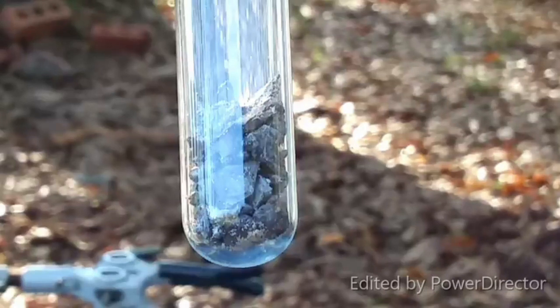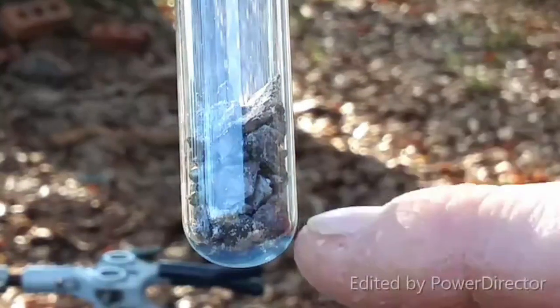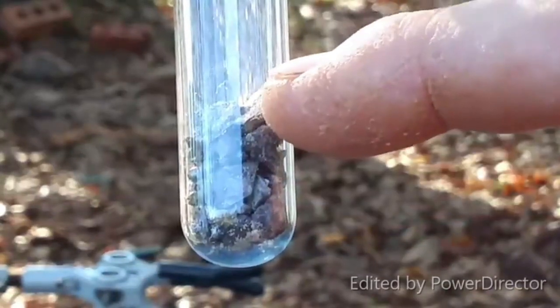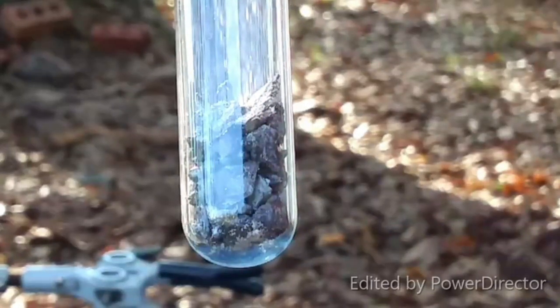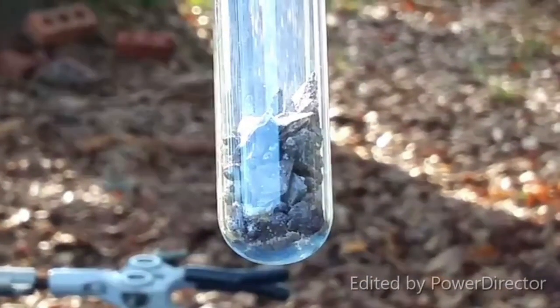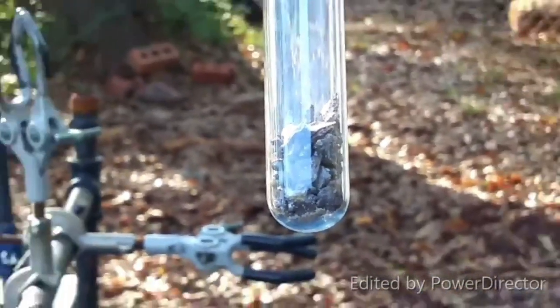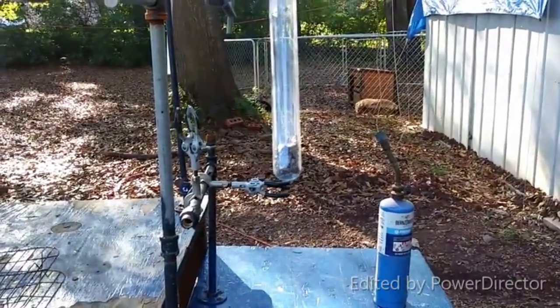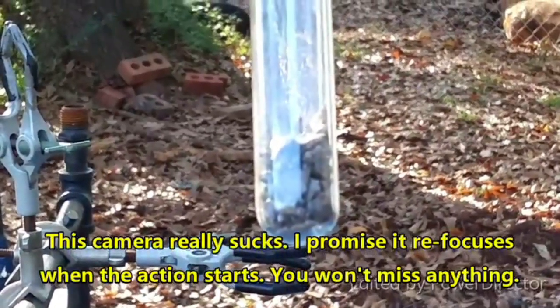Alright everyone, as promised here is the experiment where we're going to try to do indium monoiodide by direct combination of the elements. I've got a layer of indium pellets, then a few iodine pellets, and then some more indium metal. I've flushed out this tube with dry carbon dioxide and I've got a stopper on top with a hole in it to let the gases out so it doesn't pop the top off, but at the same time I hope it keeps everything more or less contained.